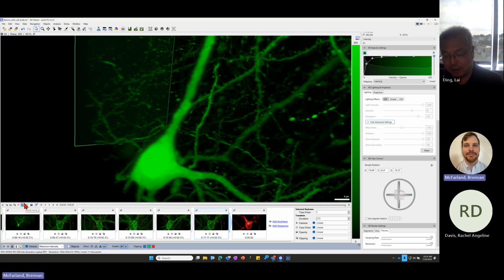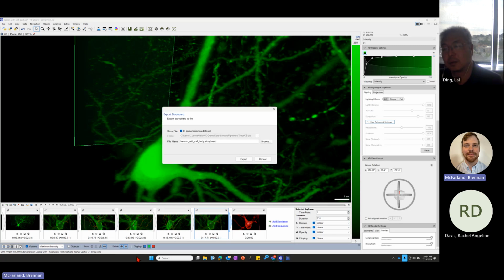Okay. But when we're done creating the movie, and let's say we do want to export from what we had here, we would save first, and it'll save it as with everything else, like pipelines and objects, everything is tied to this .sis file. So we can save this here, and it'll be saved to this .sis file, but we can also export this and save it as its own. If we need to reload it or send it to someone else, we can do that too.